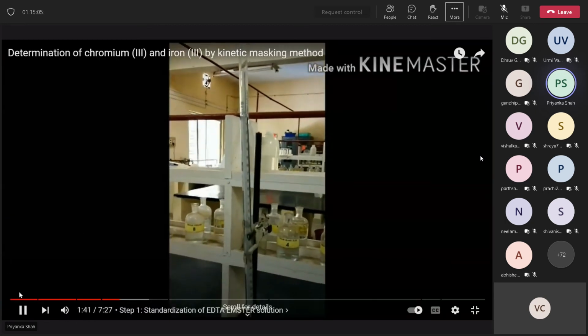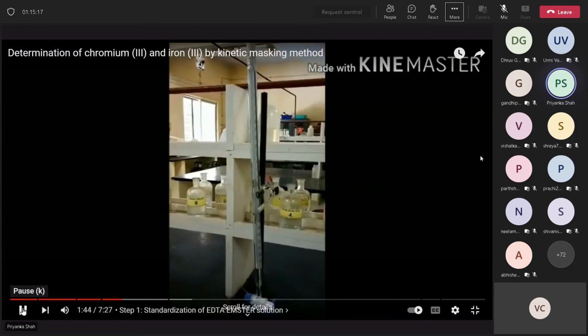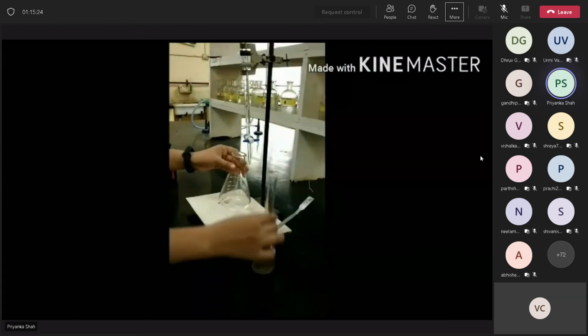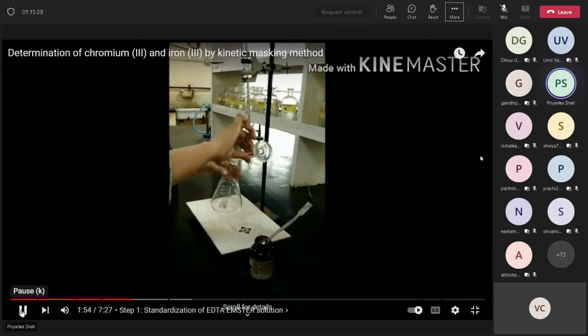For the standardization of EDTA solution, is this video audible to you all? Yes, ma'am. Okay. Take the EDTA solution in the burette and pipette out 10 ml of the zinc sulfate solution in a conical flask. To that, add 3 ml of buffer solution of pH 10.